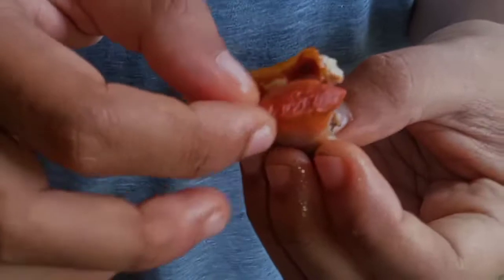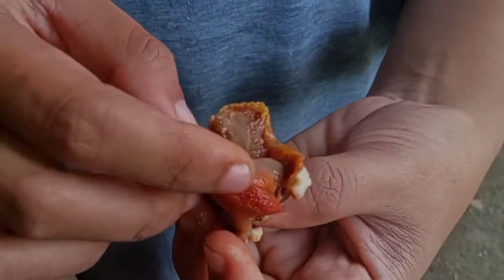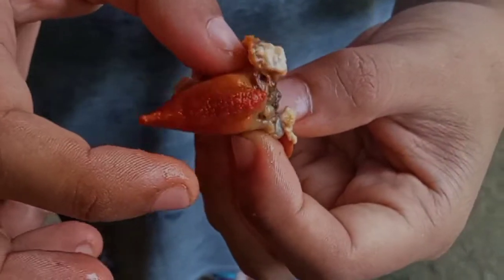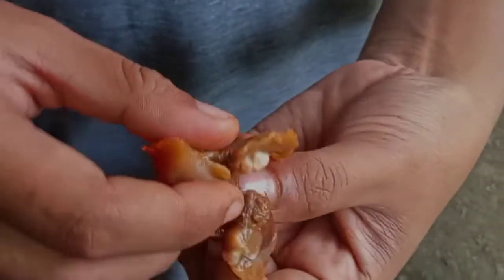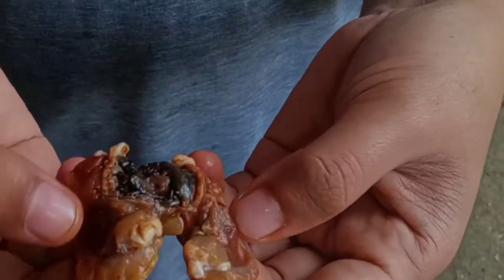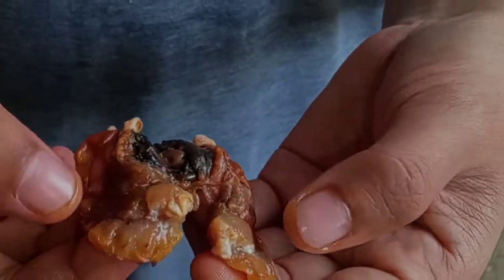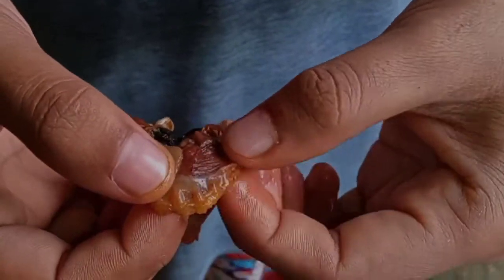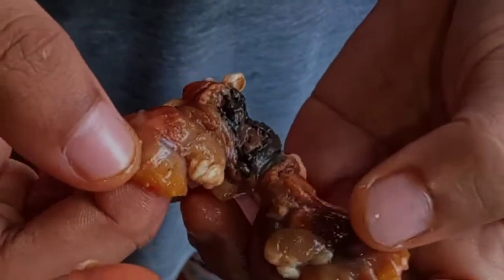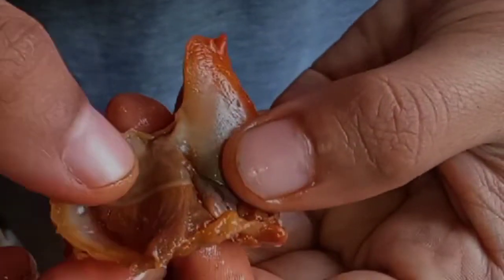I will identify the internal parts of a common cockle. This is the foot, the posterior and interior muscle, this one is the stomach, kidney, siphon, this one is the mantle, this one is the gills.